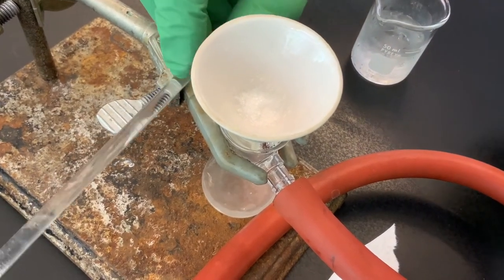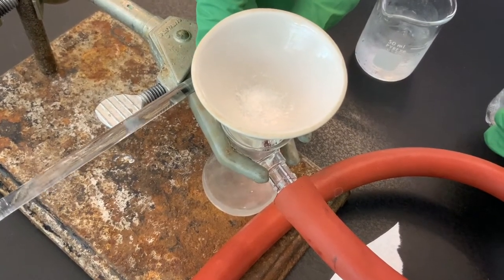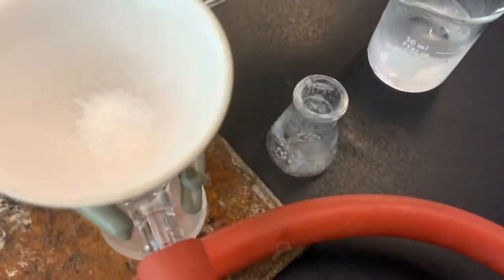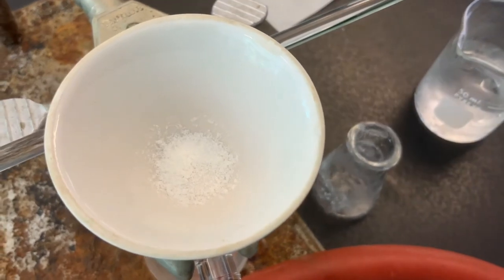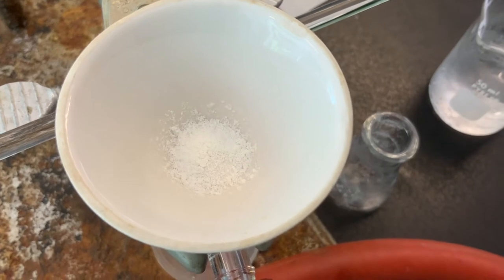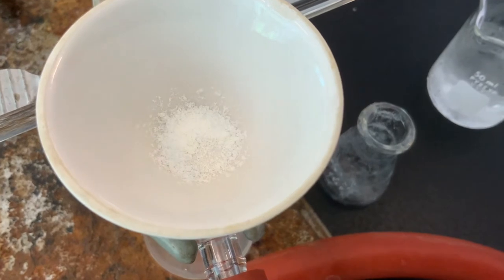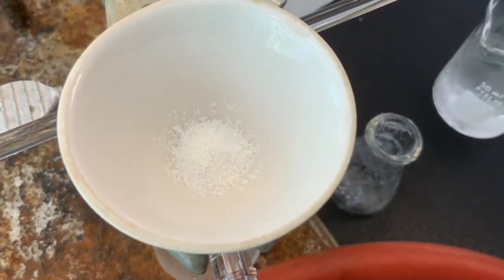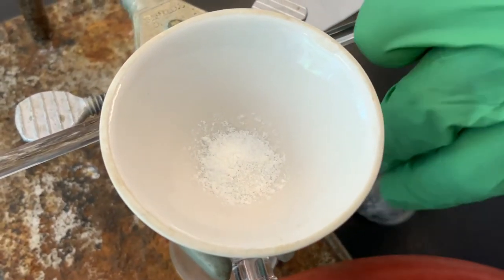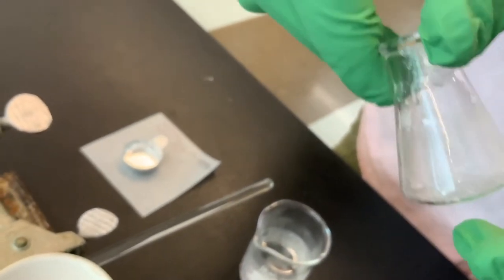And we see that now we've got our benzocaine, our filtrate has gone through, and now we're interested in this white solid benzocaine. So just remember, look back at the video and remember how benzocaine looked. That looks pretty darn similar. And so what we might want to do is just rinse it with a little bit of deionized water, just because we had it so basic. But it'll also help us get rid of the residue that's stuck onto this 10 milliliter Erlenmeyer flask.